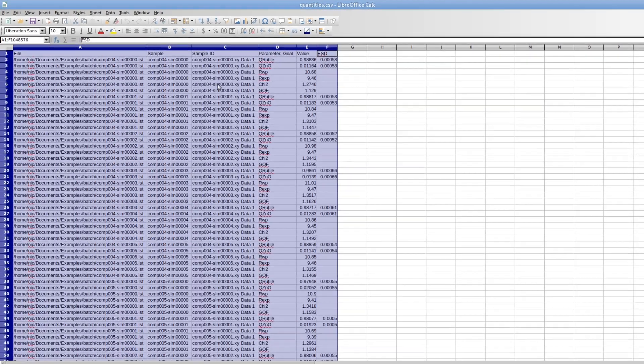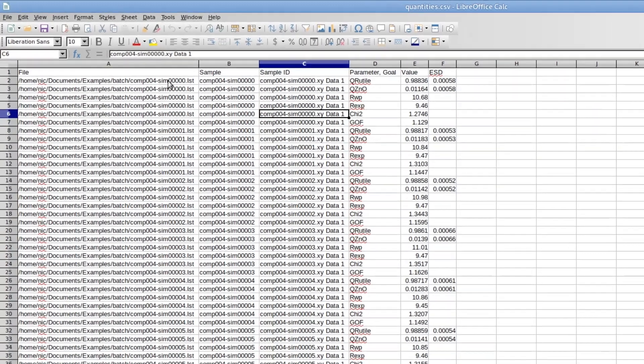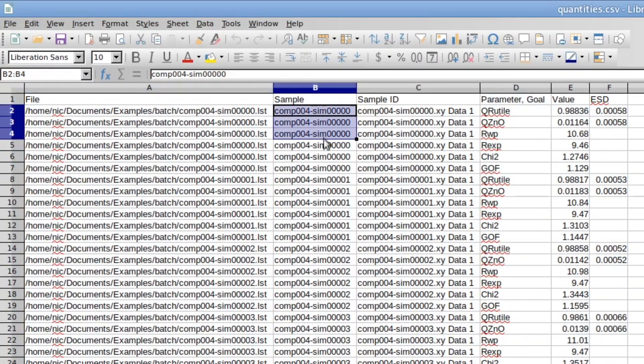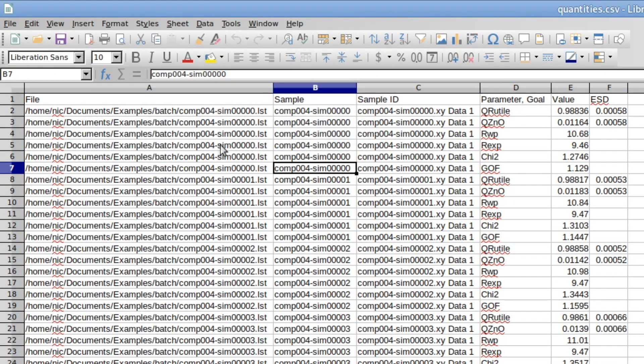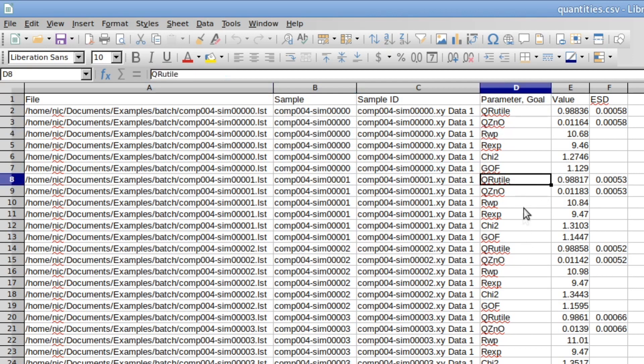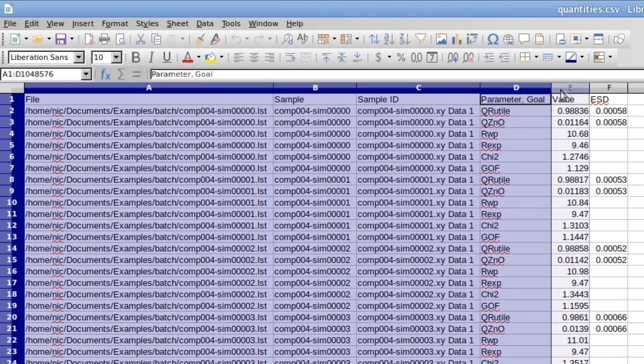And these are my global goals from all 24 refinements. So now it's sorted by sample, by data set. I have all the results, the rutile, the zincite, the quantities, the r values of the first data set and then the same results of the second data set and so on. But this is not very practical.